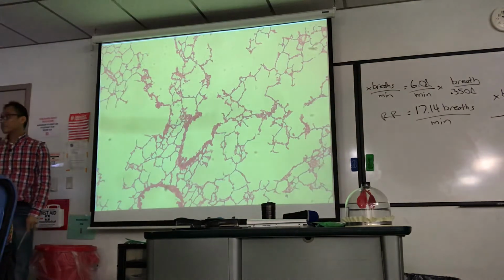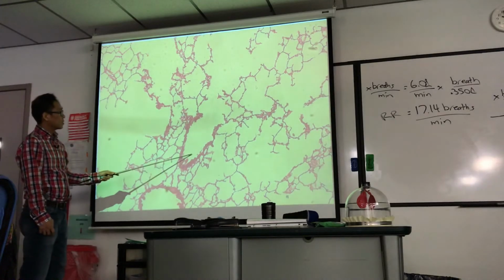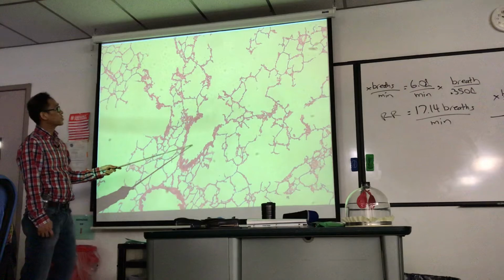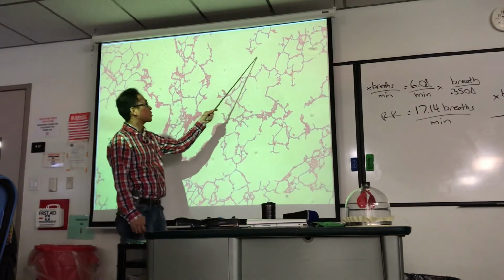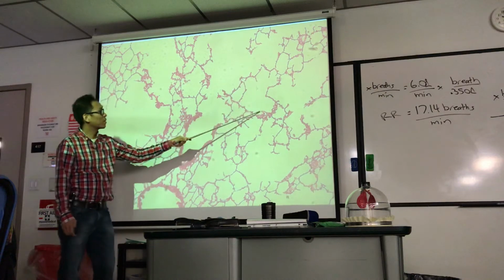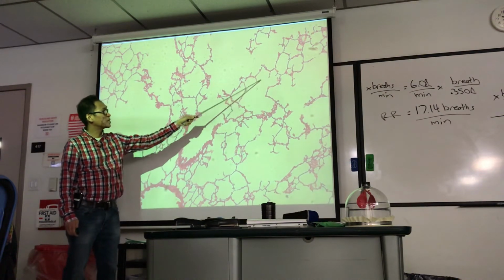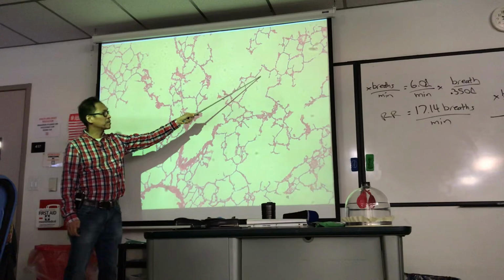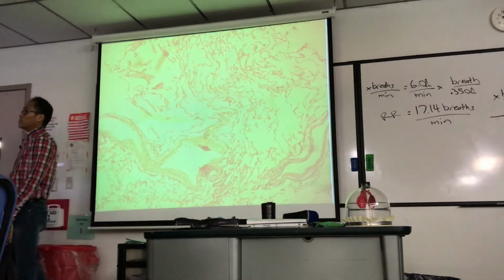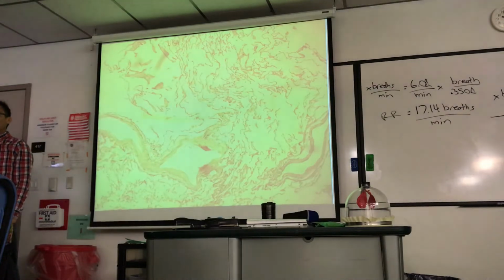Yet some more pictures. This is identify. Bronchiole. It's a close-up picture. If it looks like a hallway like that, put alveolar duct. That's a good-looking alveolar sac there. That's artifact. What's that? Alveolus. Just one little tiny alveolar space. Very good. Okay, this is emphysema lung.